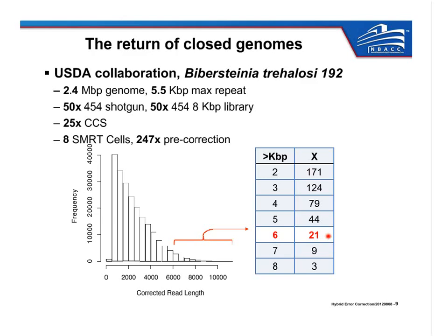Okay. Again, a couple of questions just to clarify items that I think you went over in your presentation, just to make sure everyone understands what the workflow is. Two questions. What aligner is used for mapping the short reads to the PacBio reads? And is the error correction performed after or before assembling the genome?